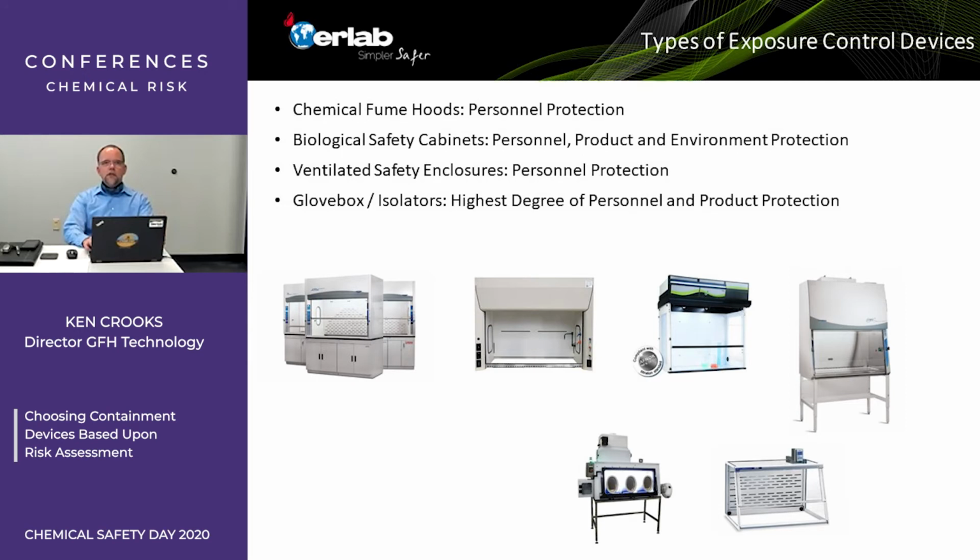Then you get into the highest degree of personnel and truly product protection also. We have a complete barrier, total separation when you have your glove box or your isolator as shown in the bottom middle picture there. So except for when you're transferring product in and out of the glove box, this is total isolation between the users.